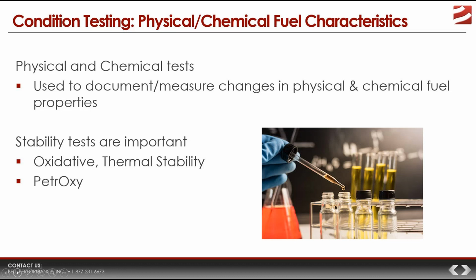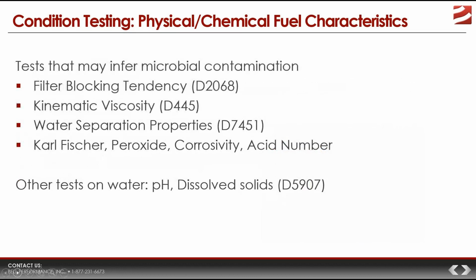And we know that if there's significant microbial presence in the fuel, it will produce unstable precursor molecules, which makes that fuel more likely to change condition in a shorter period of time. Thus, stability tests like these can give us an analytical hint about whether there might possibly be microbial contamination going on. Now, there are other physical tests that we might be able to use to assess the state of the fuel, not simply in a vacuum, but with respect to judging whether we can infer microbial contamination. A few of those are on the screen.